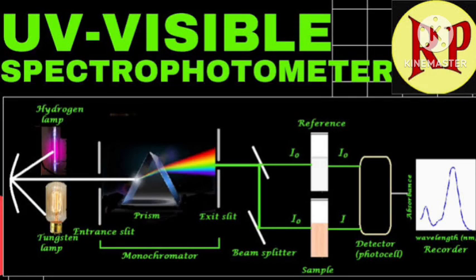Hello everyone. Today I am discussing the topic of the UV visible spectrophotometer. The title says itself that it depends on UV and visible rays. Let us see what the requirements are first.